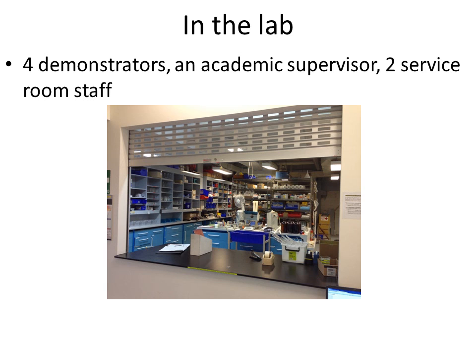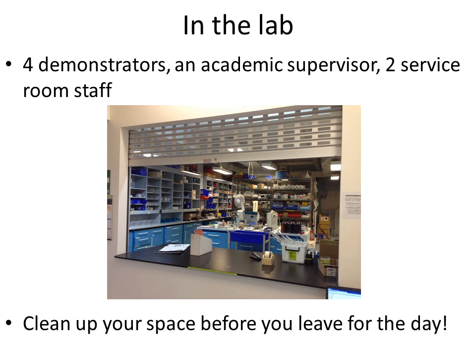From time to time, the demonstrator may also gather the group together to go over some aspect of the experiment or data analysis. You must also make sure you finish in plenty of time to clean up and leave at 5. The lab doors shut and lock at 5:15, so you must be out by then. You must clean up your lab space before you leave and leave it looking the same as when you came in. Students the next day will be using the same equipment and glassware as you, so you need to make sure that things are neat and tidy for the next lot of students. If you leave without cleaning up, you may be penalised 10% of your mark.